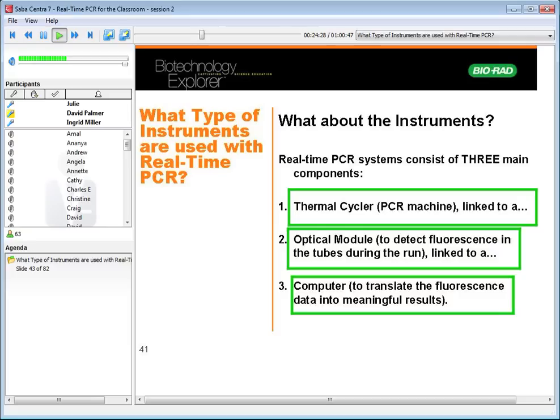And a well-optimized PCR reaction, when spread out on a standard curve, if you take your template and dilute it tenfold, will have nice evenly spaced points on a standard curve, and all the replicates will essentially be lines right on top of each other. So at 100% efficiency, or a perfect doubling every reaction, tenfold serial dilutions will be spaced 3.3 cycles apart from each other. And this graph shows a really nicely optimized reaction. You could get really good quantitative data from that.